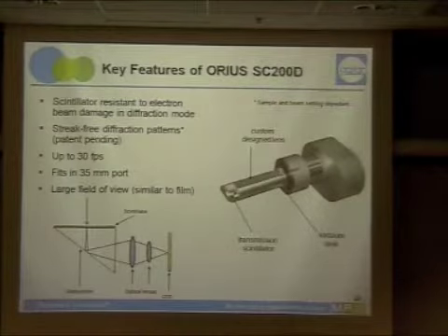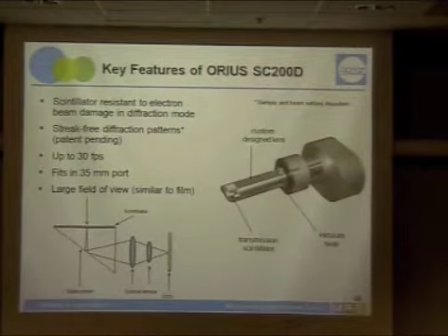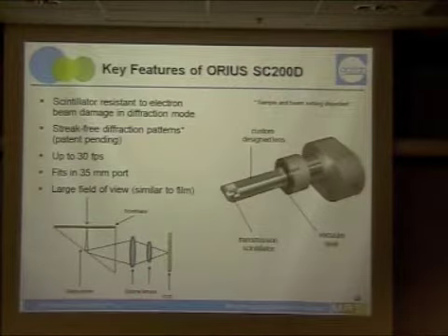So I thought this lens coupled thing is ultra difficult to do, and you need a huge active focusing of that. Well, so it's more... I think it's, let's see. I mean, this is a standard part of these top mount resolution cameras.